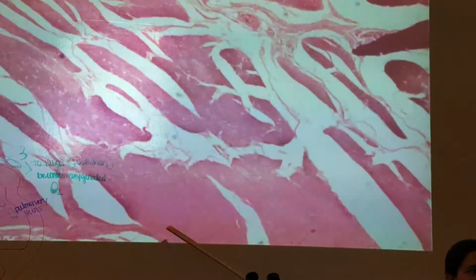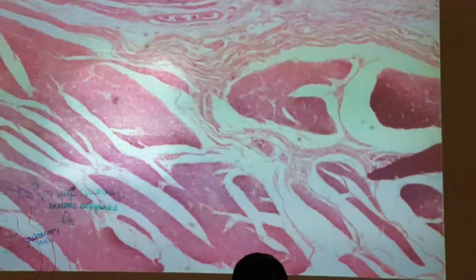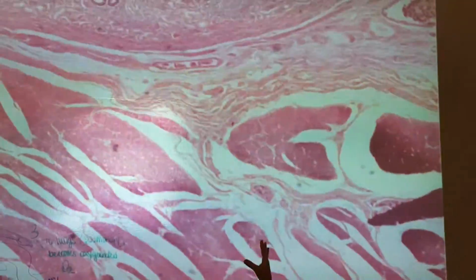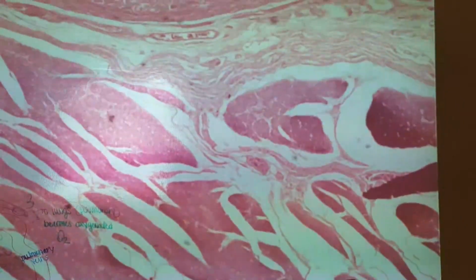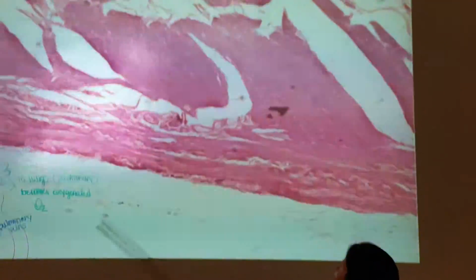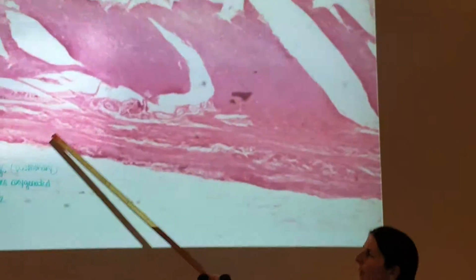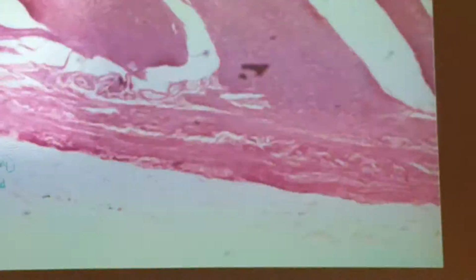muscularis externa layer. Now, again, we'd have to give you some other field of view, and through the microscope, I can see much more of the top of the field of view. So again, to know that it's the stomach, that's the muscle part to it, that's the muscularis externa layer, you should be able to do that. Now, as far as that serosa layer, after the muscularis externa layer, there's another neater boundary to it, and that's going to be your outside boundary, and that's the serosa.